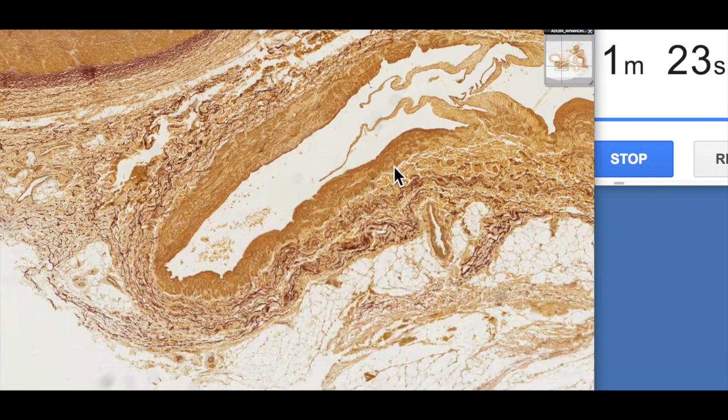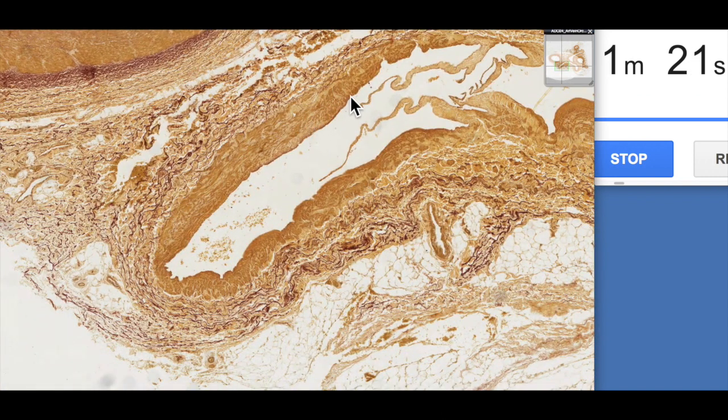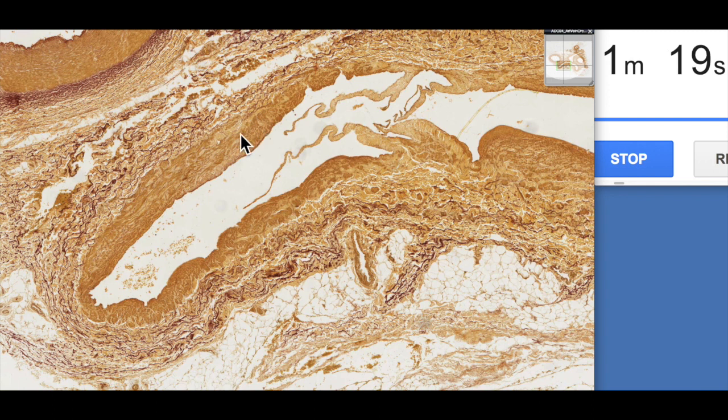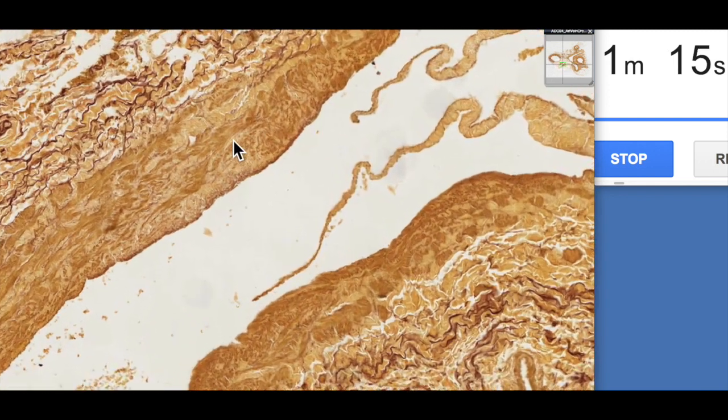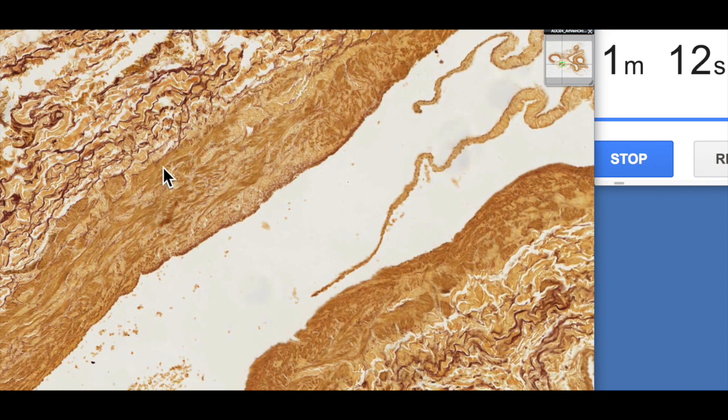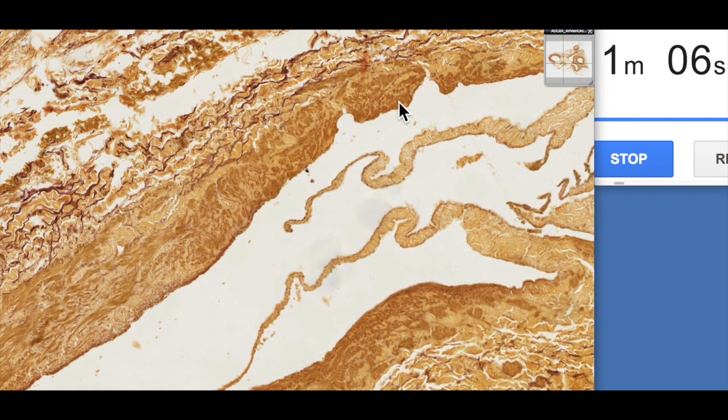If we go out here to the vein, we can actually see it's very irregular in shape. There's not a lot of thickness to its wall. We zoom in a little bit. We can see this sort of irregularly dispersed smooth muscle here. There's not that internal elastic lamellae like we saw with the muscular artery.